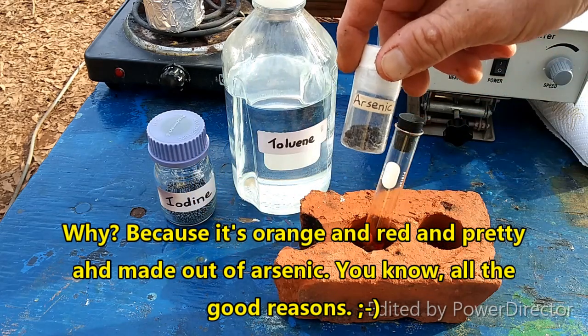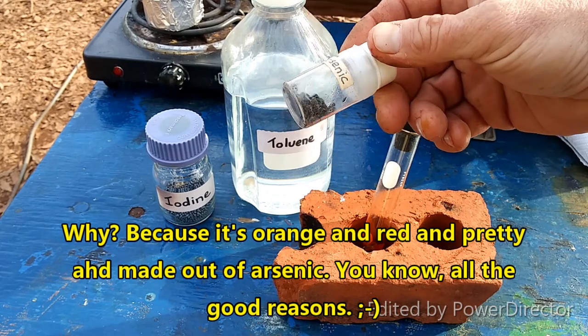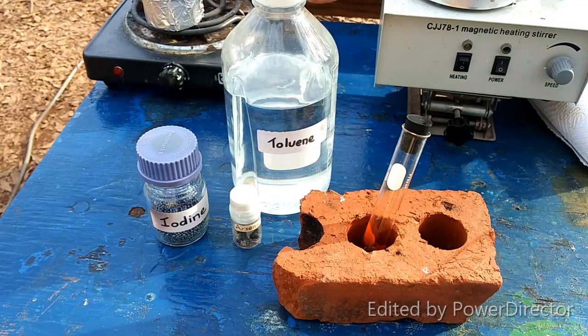Right here — you can see it's covered with a black oxide layer. I'm going to use good old elemental iodine and toluene.